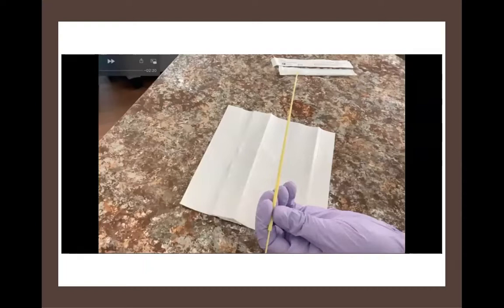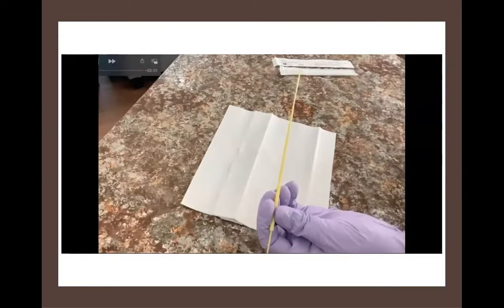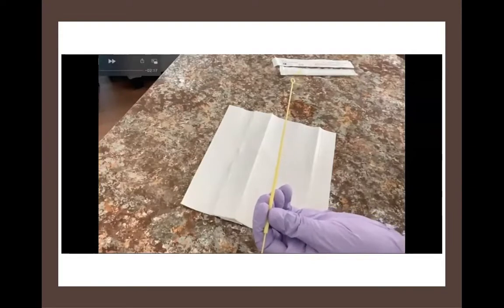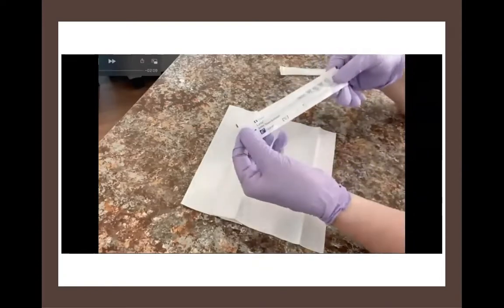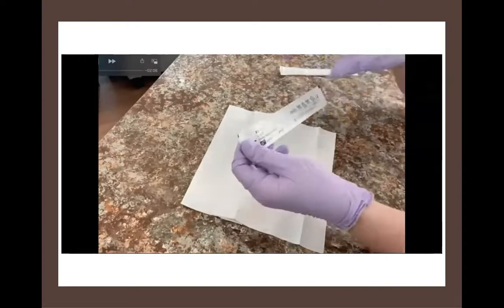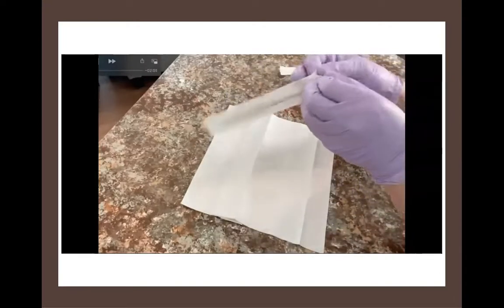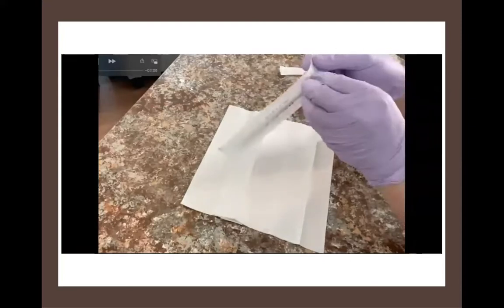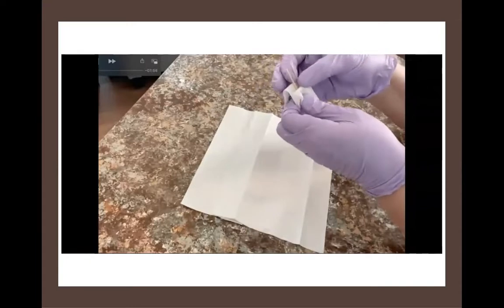Well, the next item that we can look at is the disposable cotton swab. Those are very useful in the microbiology lab. They come in these sterile packages. There's usually 2 swabs in the package. You can only open these packages at one end. And again, just like with the loops, that allows you to open the package at the end opposite to the swab.